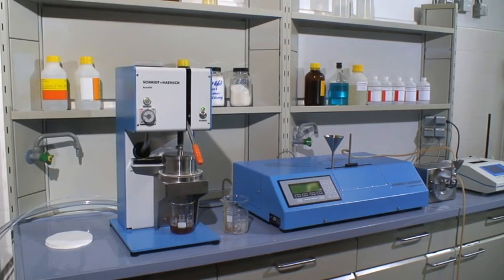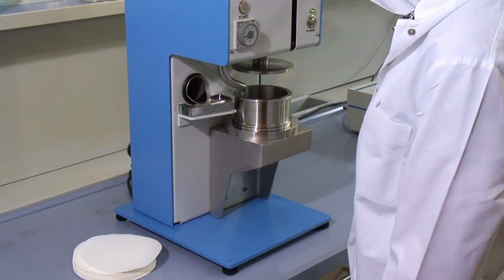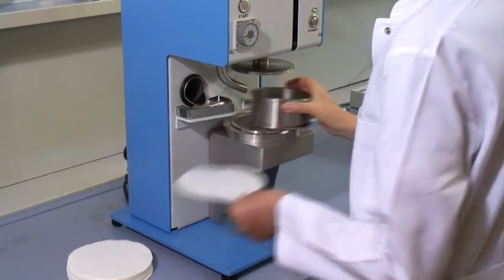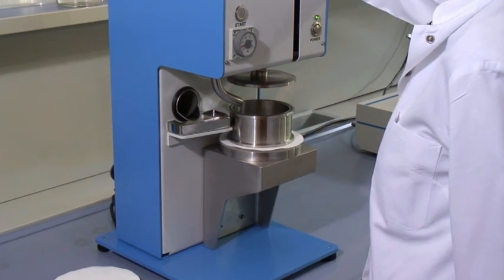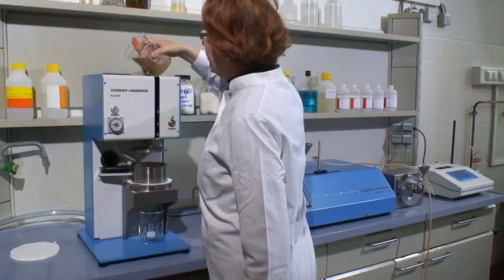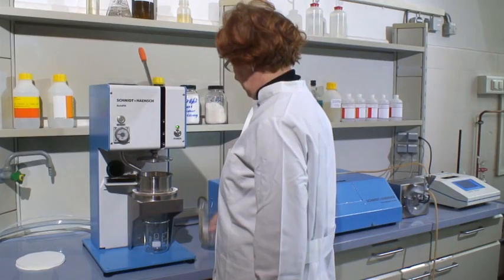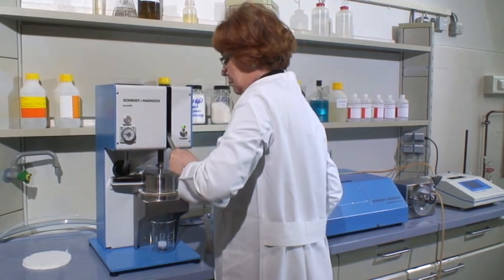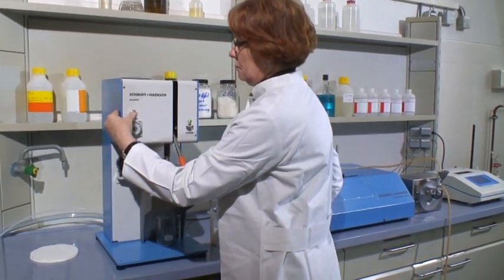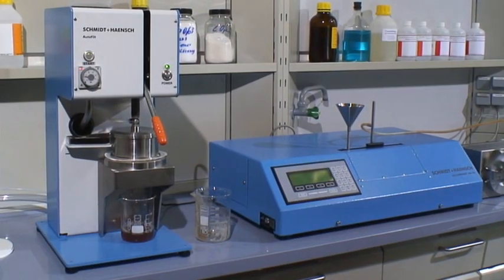The Autofilt is an effective possibility for clarifying samples automatically. To start the procedure, it is fitted with one or two filter pads having a pore size of 7 to 10 microns. The filtration cylinder has to be lifted and dropped down after insertion of the filter pads. After having filled the sample into the funnel of the Autofilt, the sample room is closed by the red lever and the starting key is pressed. You see the quick and easy filtration of the solution.